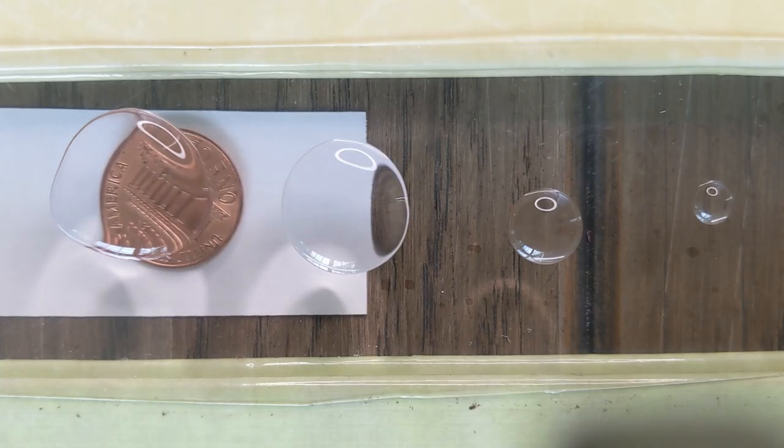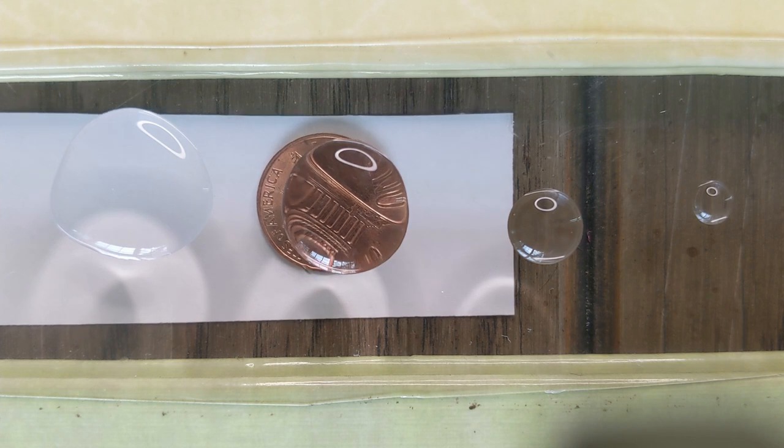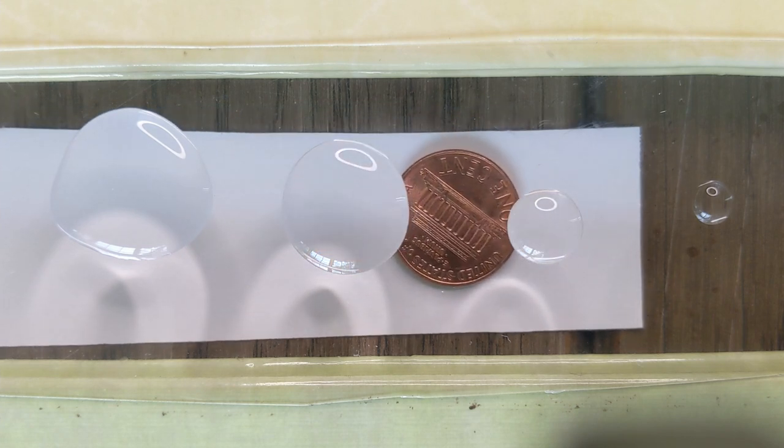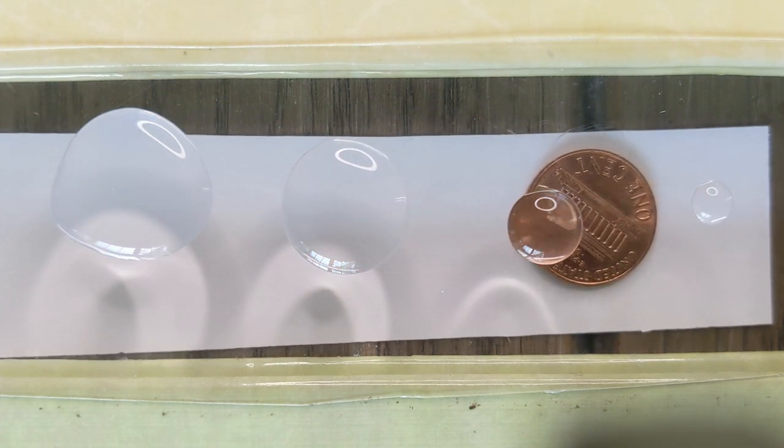This microscope can actually see cells. To understand how this works, there's a very simple demonstration we need to show you first. A drop of water can bend light.